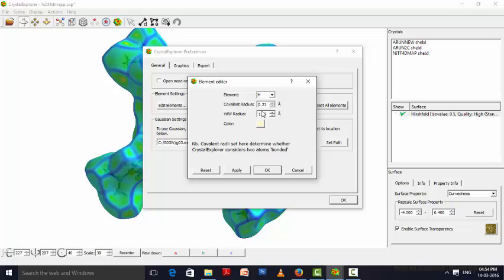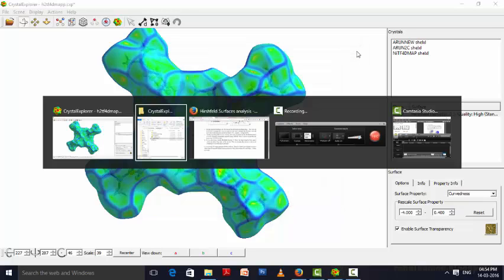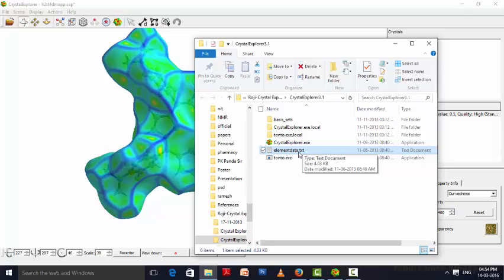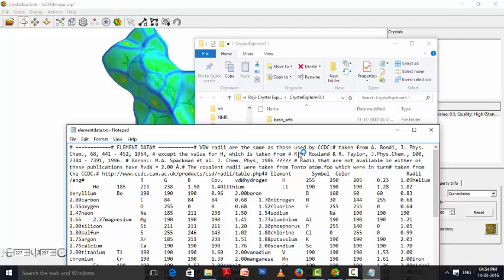Or another option is you can take Crystal Explorer folder. In that you can see element data text file. There also you can edit it. Here you can see element name, element symbol, color, radii, M1 angle, RGB color, then van der Waals radii.